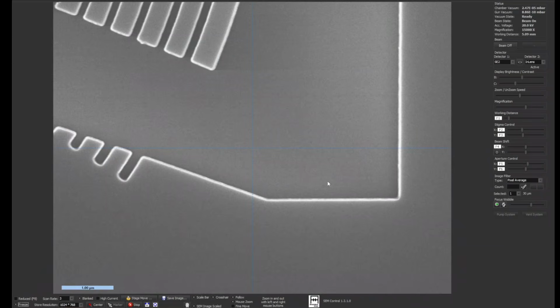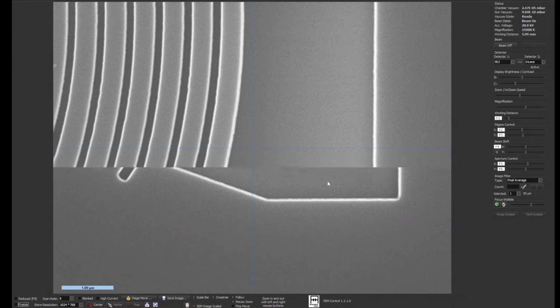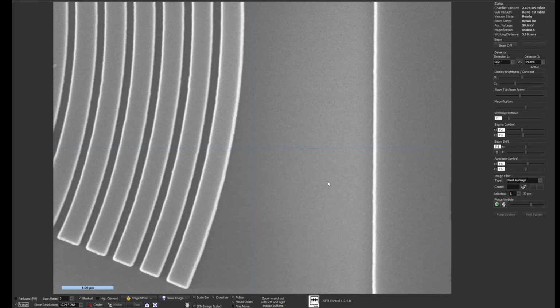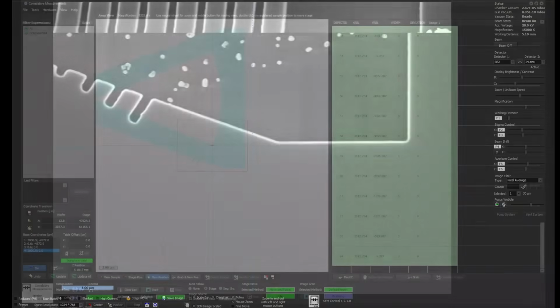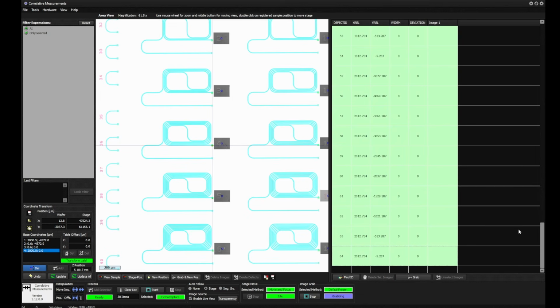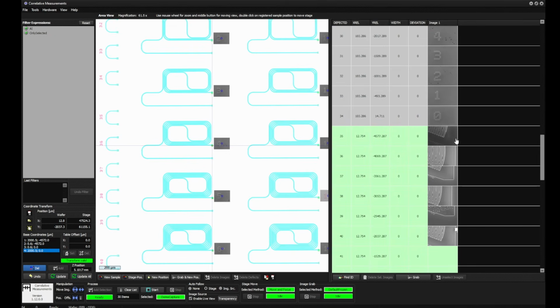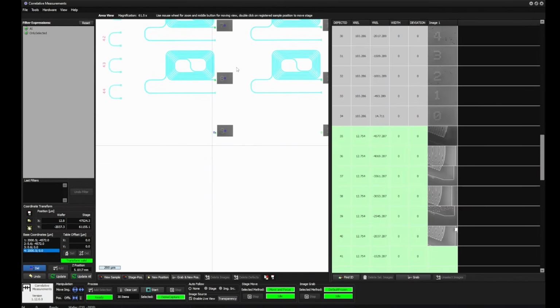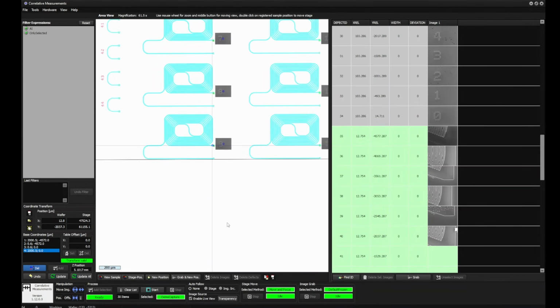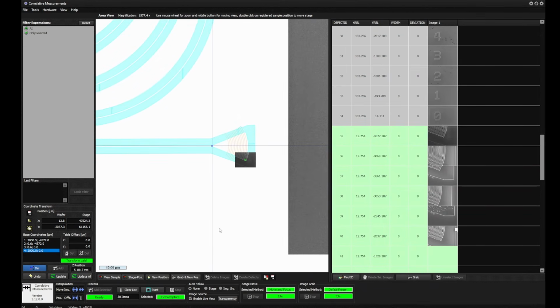And now you can also see this here in the SEM. We hit somewhere, but actually not at the place where we want to record the image. I can stop this here. Let us see if we scroll up. You see that they are totally shifted, and this makes no sense, to do just positioning without having any reference at this high magnification.